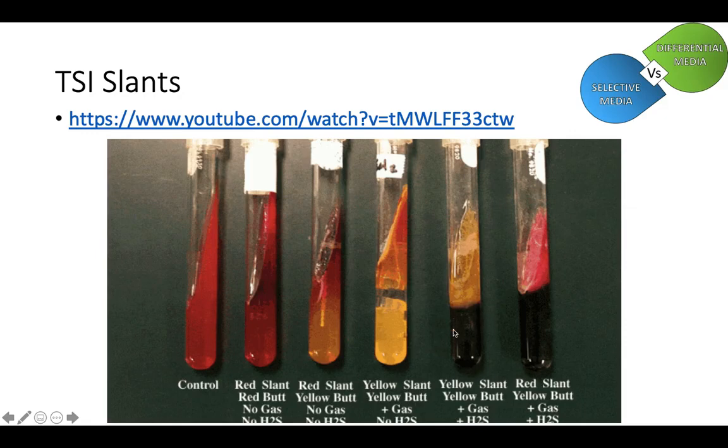There's a little bit of sulfur inside of this media, a small sulfur source. Some organisms are capable of eating it. Some of them are not. And that's also a little bit of information that you can get. If you're a bacteria species that's able to eat it, that's something that's useful to know if you're trying to diagnose the bacteria found inside of your patient. Can they eat this? Is the species that they're infected with able to eat sulfur or not? And then you can use that information to diagnose your patient and figure out what they've got.